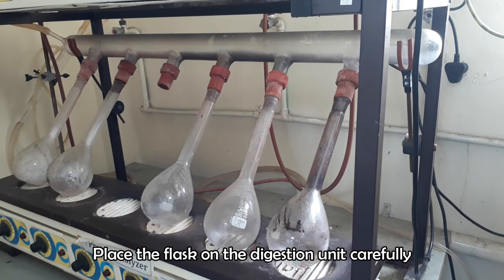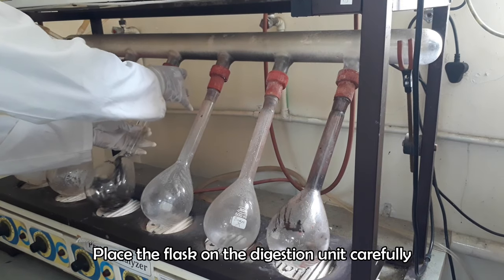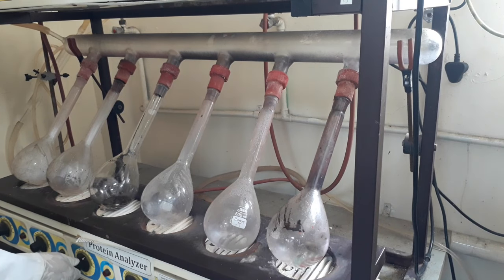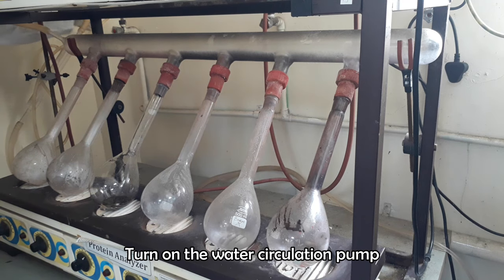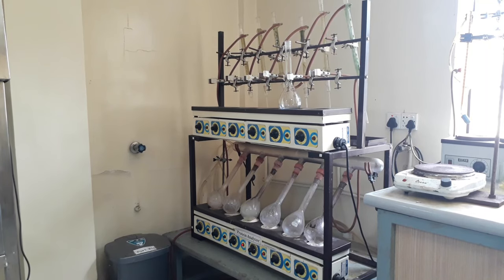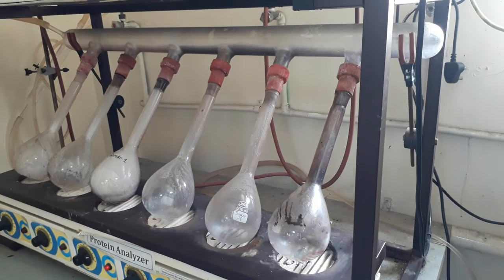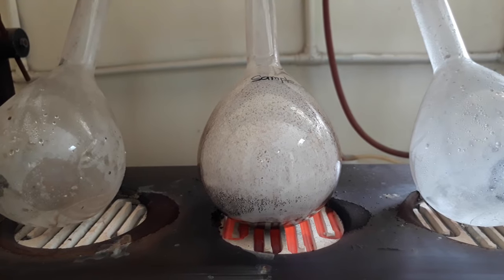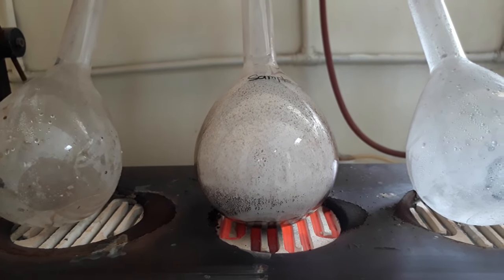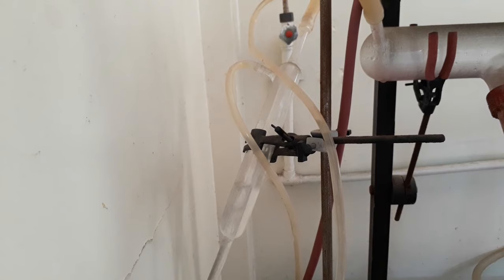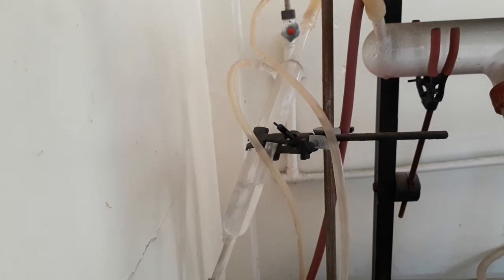Finally place the sample containing flask on the digester unit. Turn on the digester and heat the flask at 200 to 300 degrees Celsius. If you use a manual digester, don't forget to turn on the water circulation pump of fume receiving unit. Run the digester for 2 hours.